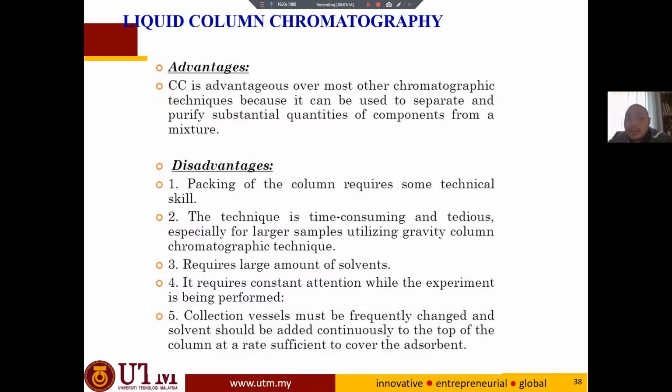But liquid column chromatography is one of the techniques especially in chromatography. The other things, for example temperature, distillation or density, are another story.